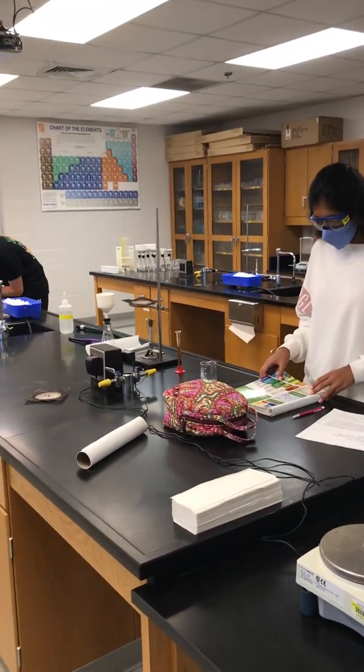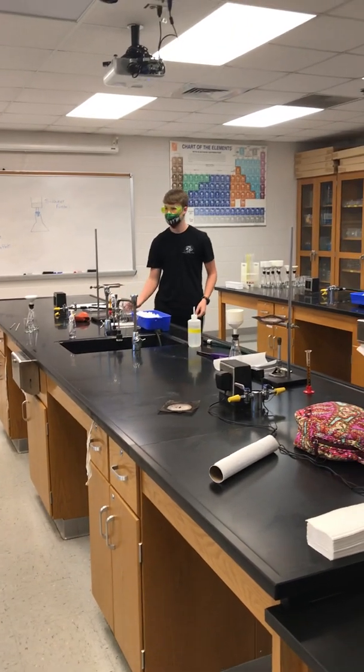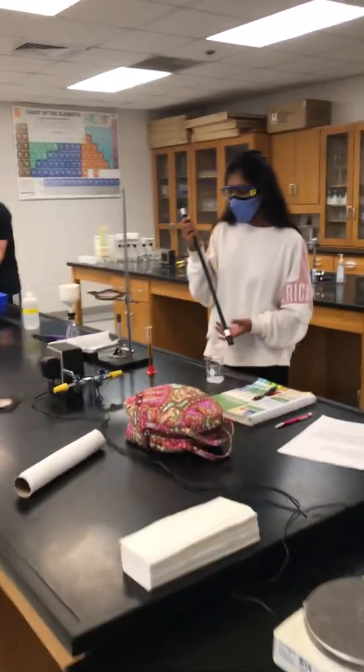Before you start writing all that in there, just go ahead and start heating it up so we can get going. You might want to hook the gas line up to the burner.